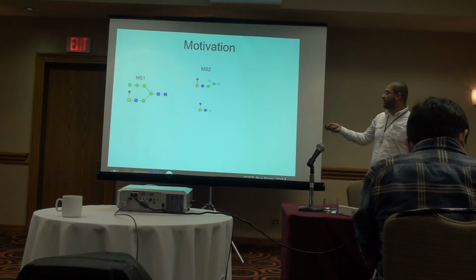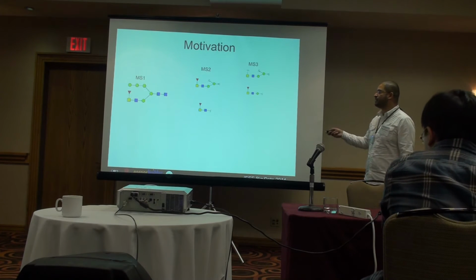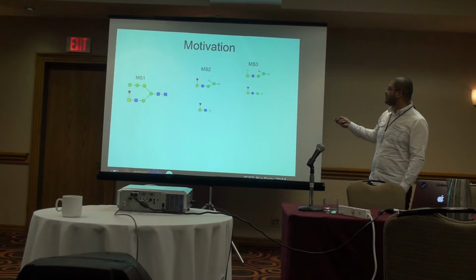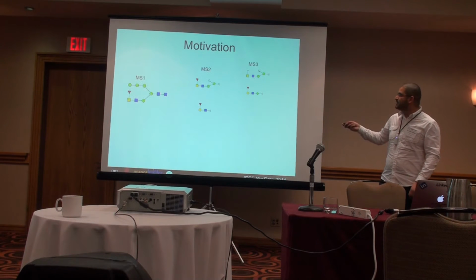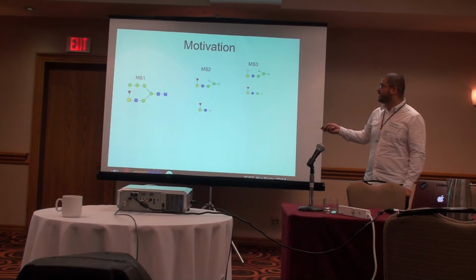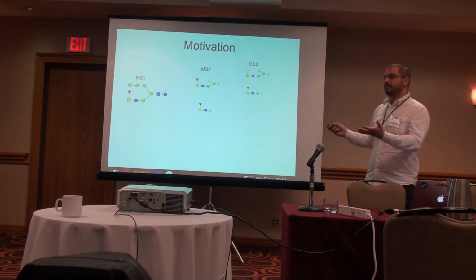So what they do, they break it into pieces, and then they break those pieces into pieces if they cannot recognize the structure by looking at those pieces, as MS2, and they call this MS3. So they can keep going until MSn, until they find some pieces that say, hey, this piece belongs only to this structure, and then in this case they can recognize that the glycan structure exists in your body. So this is the problem.